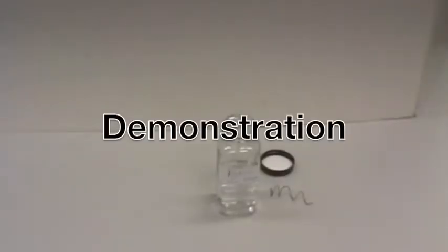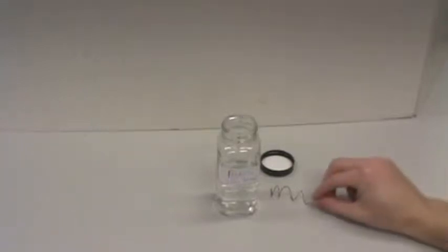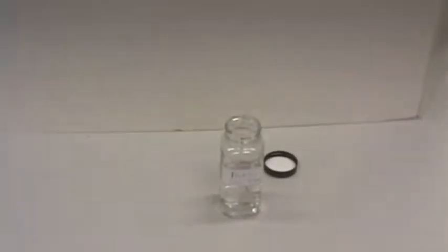Show students the jar containing silver nitrate solution. Place the piece of copper wire into the jar. Tell the students that you will show them the jar again at the end of the lesson.